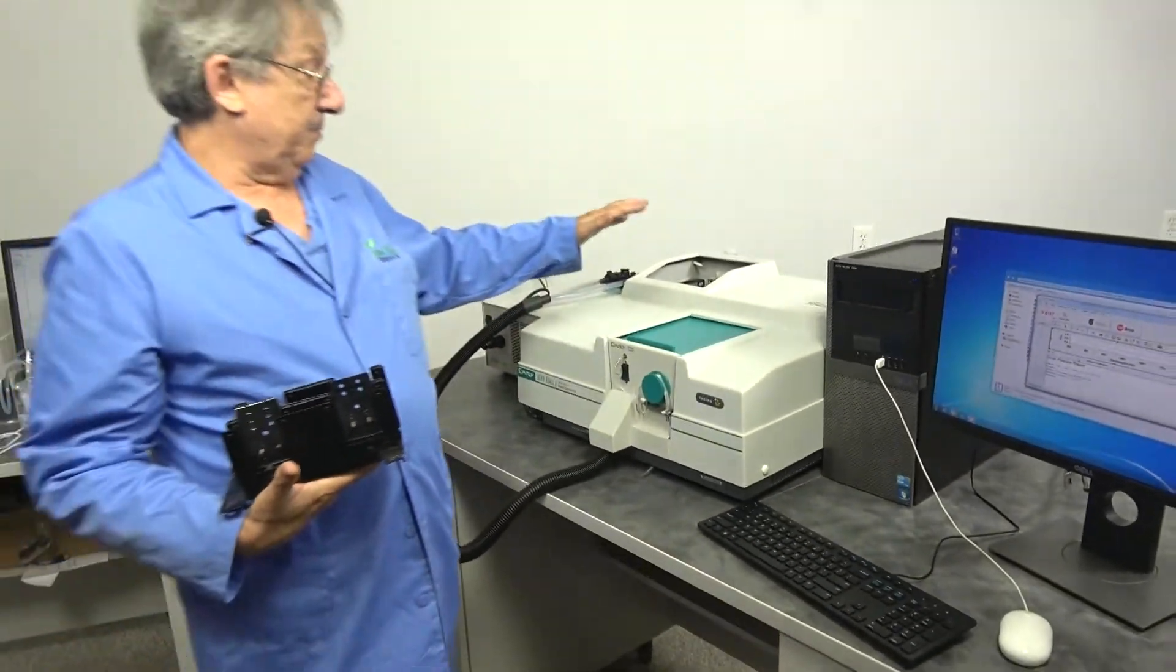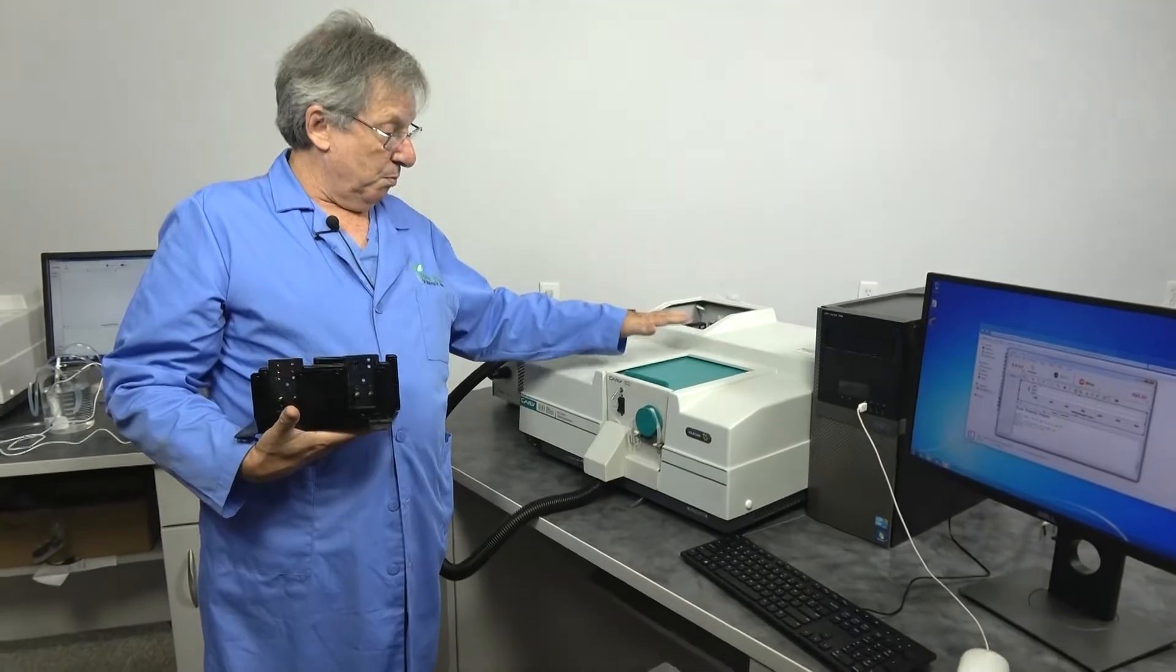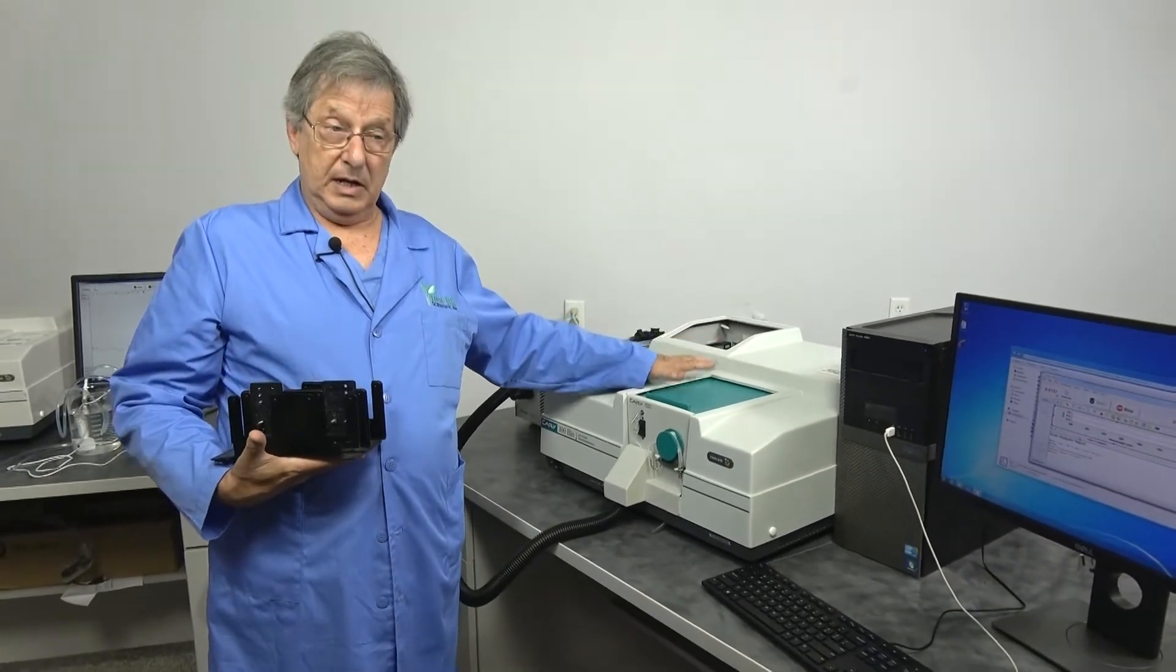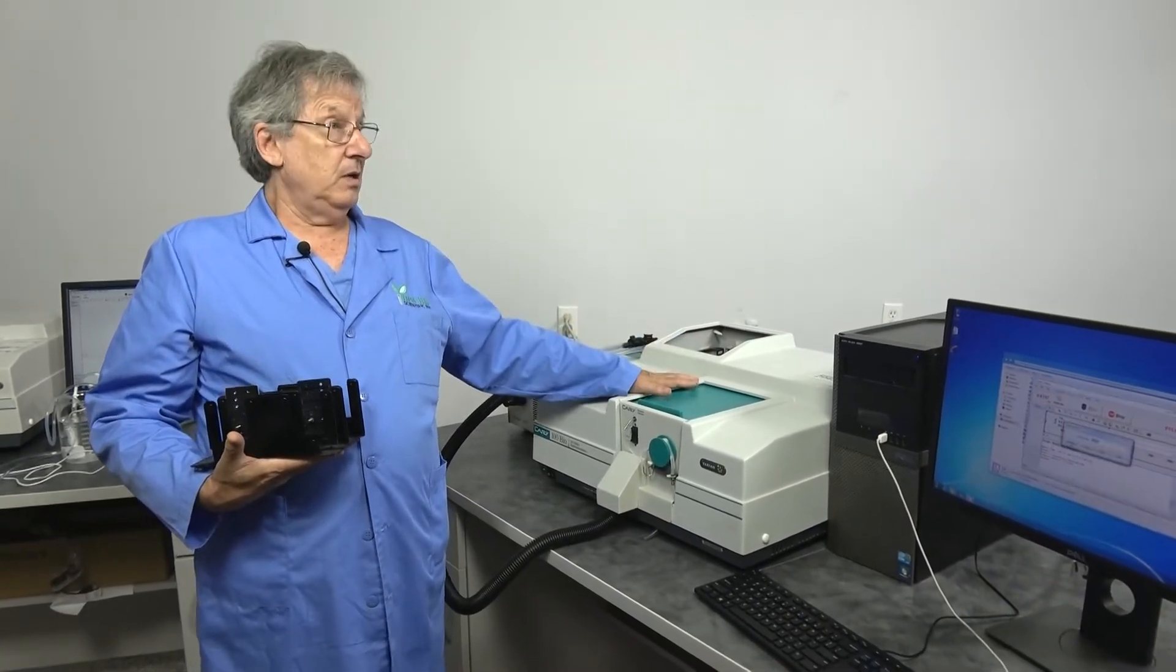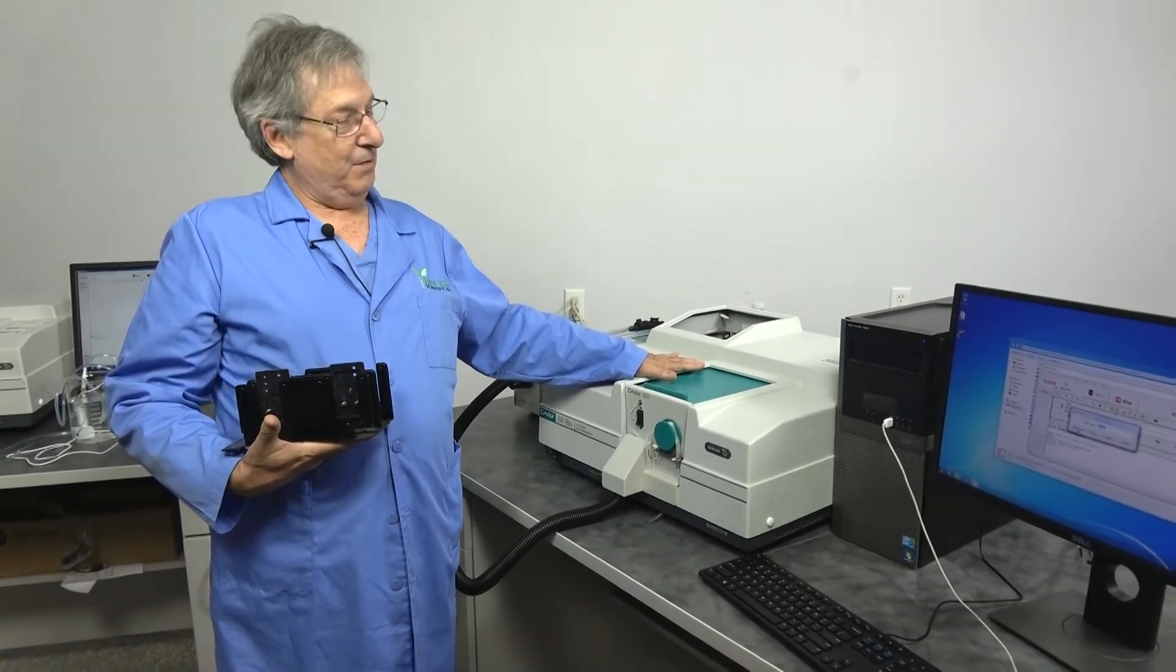So that's some accessories that may help you in getting your tasks done in your lab. Check them out. Thank you very much.